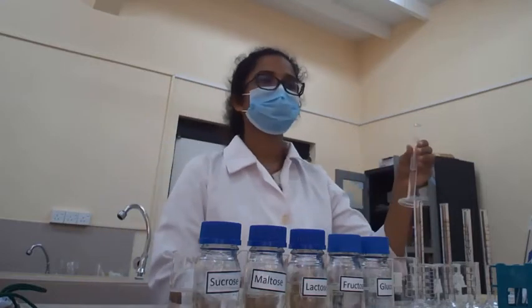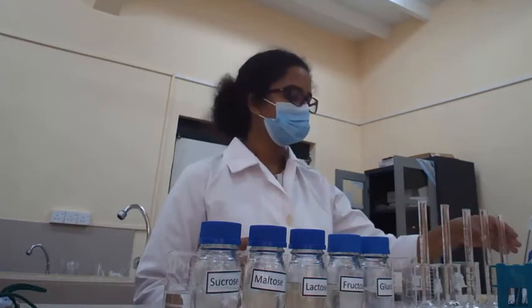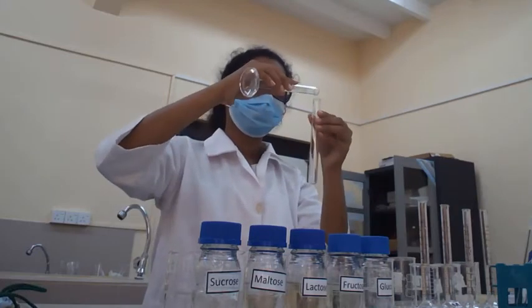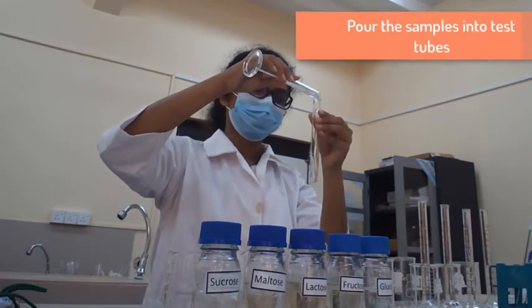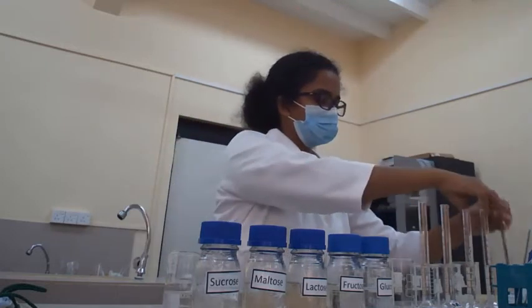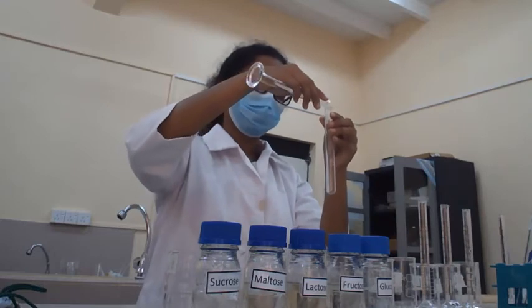Likewise, we are going to measure 5 milliliters from each of these solutions. Then after measuring 5 milliliters, we are going to add them into separate test tubes. Now we are adding fructose.